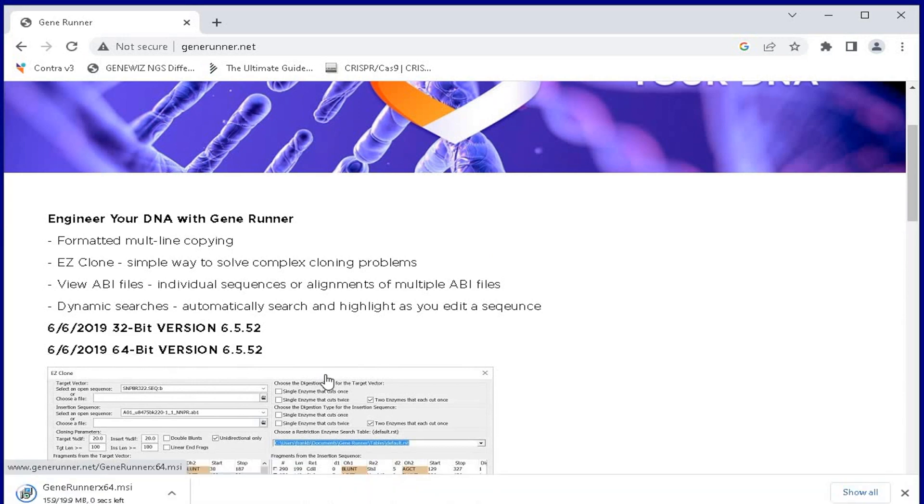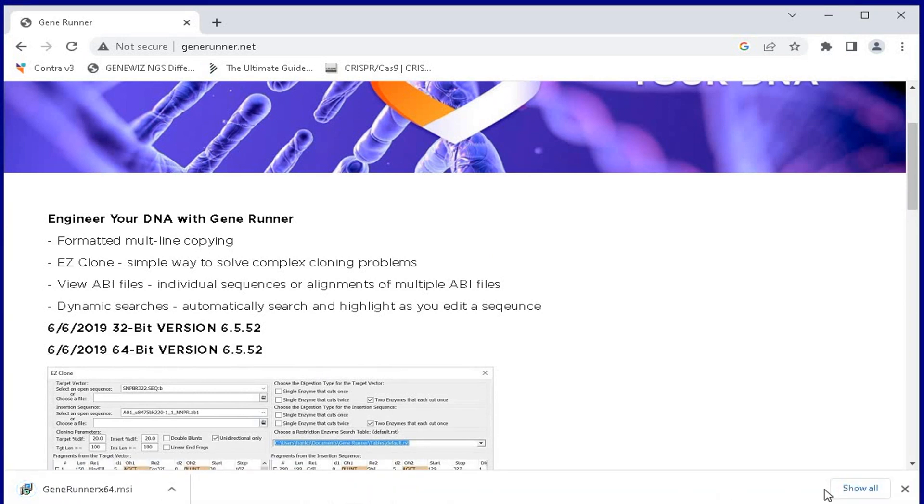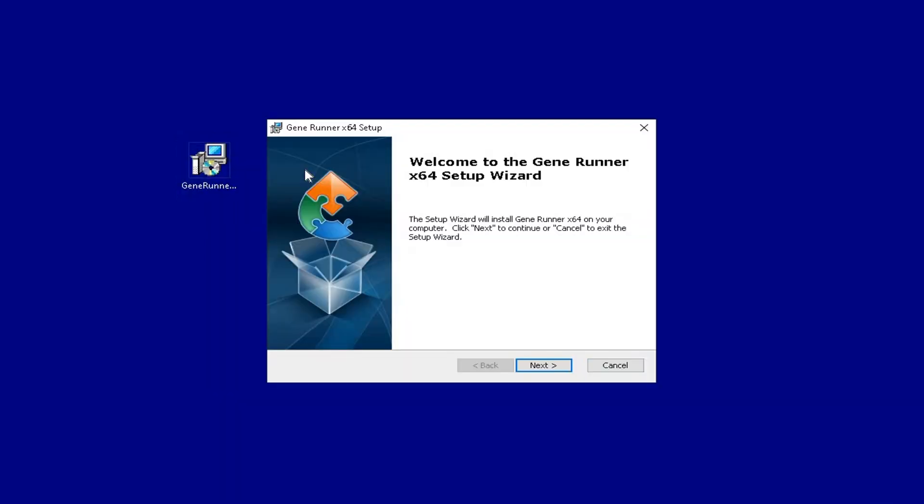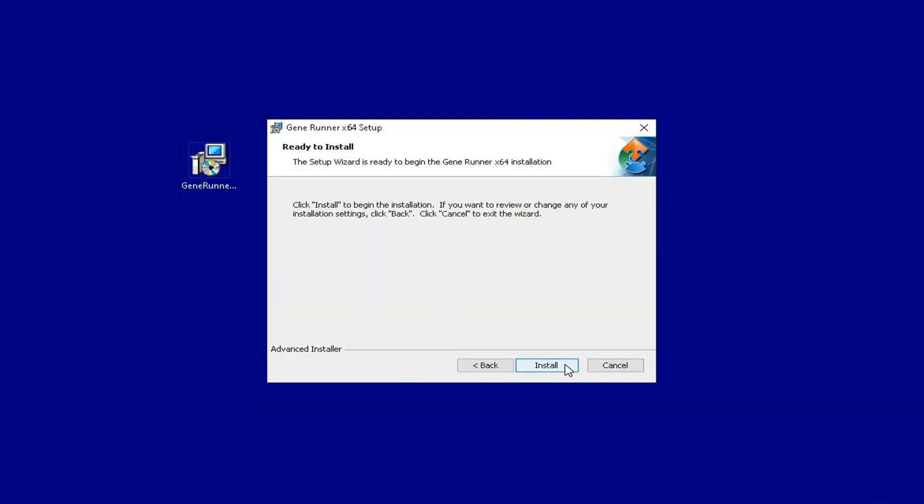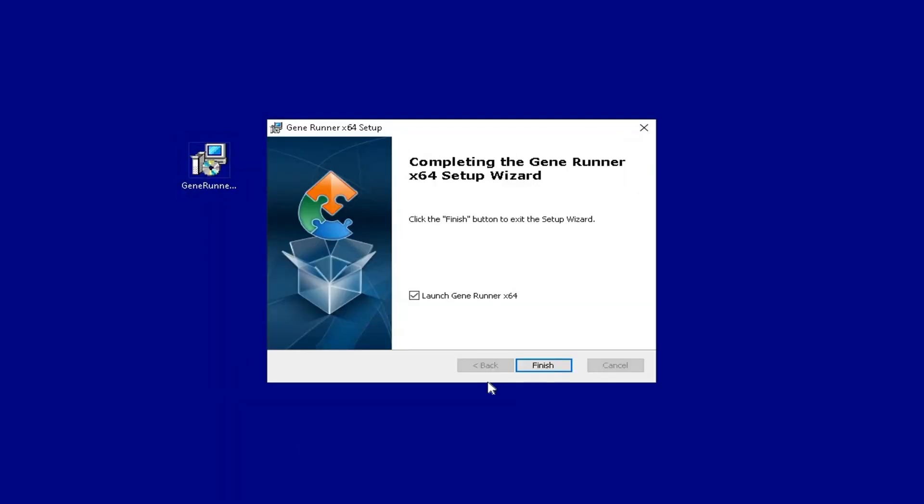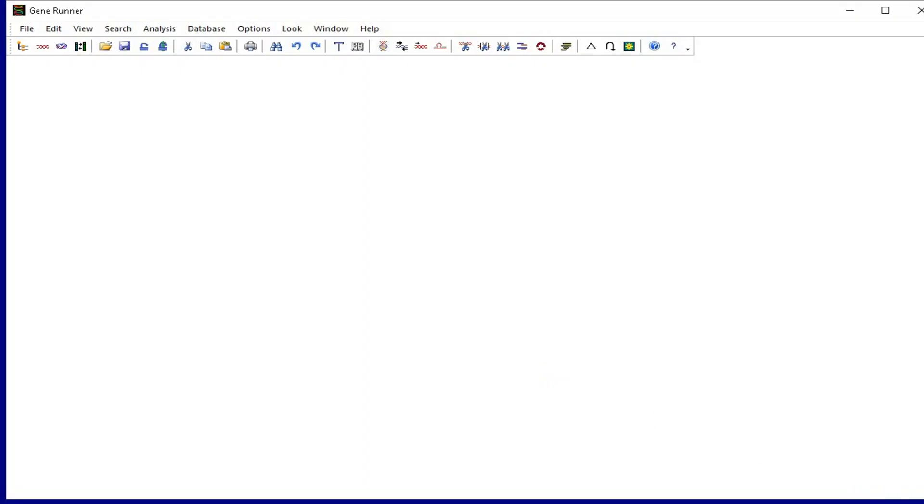Download the software according to the operating system and follow the instructions to install the GeneRunner software. Once the installation is over, the software is ready to be launched.